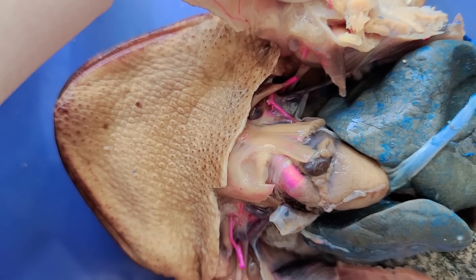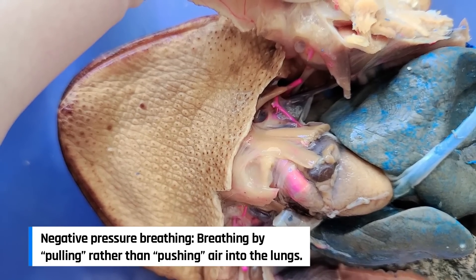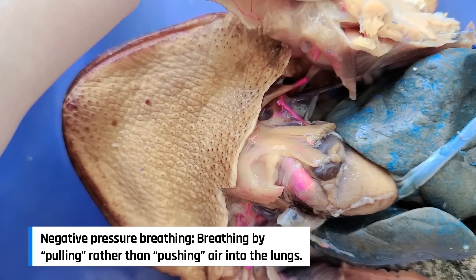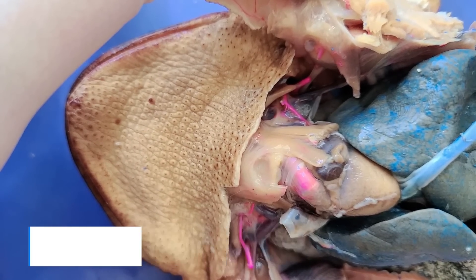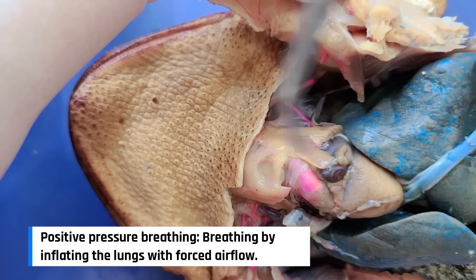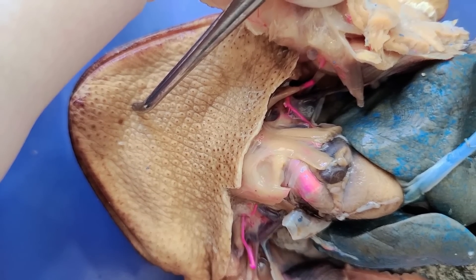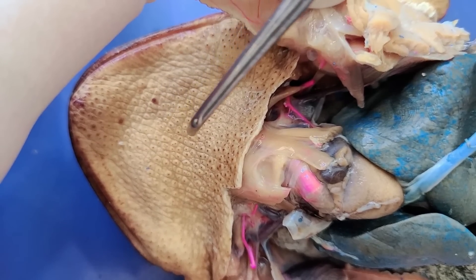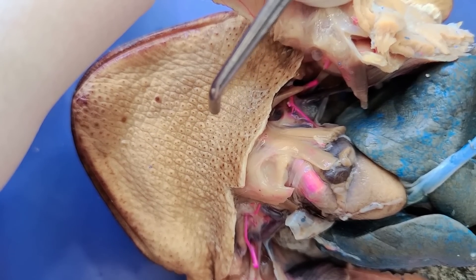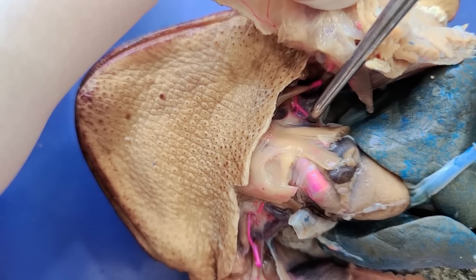Toads don't really breathe in the same way we do. In humans, breathing occurs when the chest cavity expands and sucks in outside air into the lungs through negative pressure. Toads have something called positive pressure breathing. The toad draws air into its mouth by expanding its throat, increasing the volume of its mouth. Then it opens its nostrils, allowing air to enter and fill the enlarged mouth. Then the nostrils close and air in the mouth is forced into the lungs as the throat contracts.